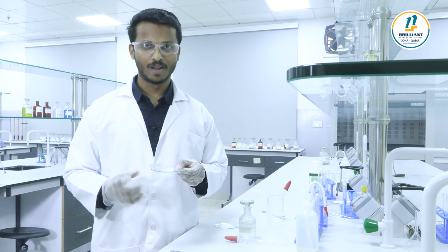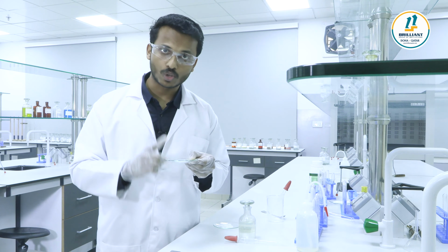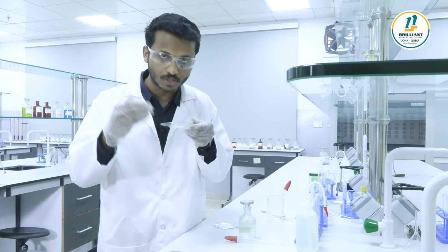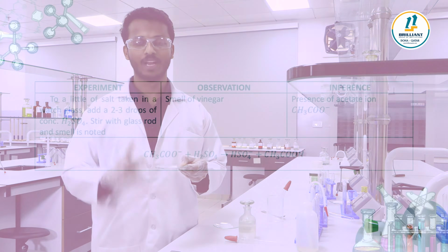If you're getting a vinegar smell, then you can say that the given salt may contain acetate as anion. But if you want to ensure that it's an acetate ion, we have to do the confirmatory test. So what is this test? To a little of salt, add 2-3 drops of concentrated H2SO4, rub it with a glass rod and try to get the odor. If you're getting a vinegar smell, it indicates that it may contain acetate as anion.